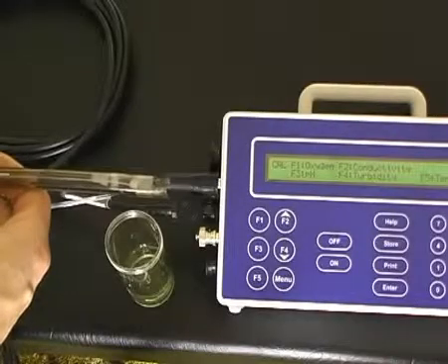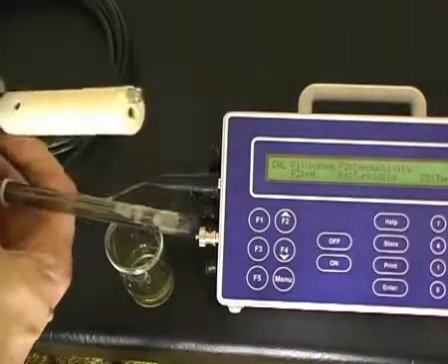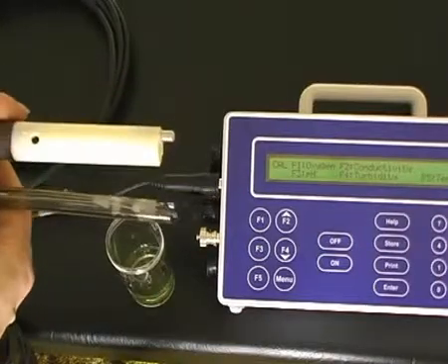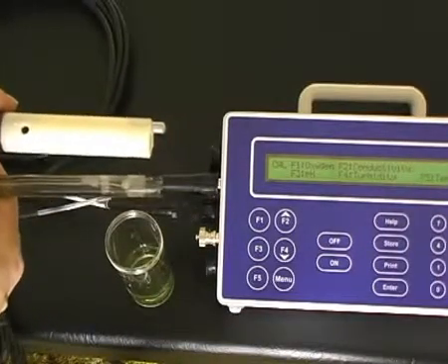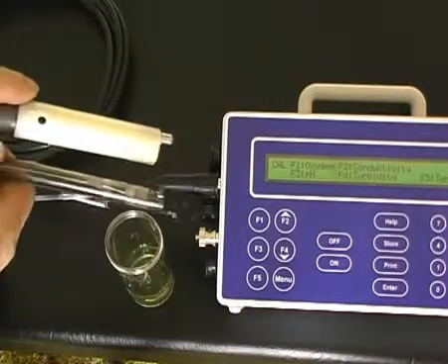To calibrate the pH sensor, you must also include the conductivity sensor, which has a temperature sensor on the end of it. Both sensors must be in the solution at the same time. Here, we're about to calibrate pH 4, the first point pH calibration.